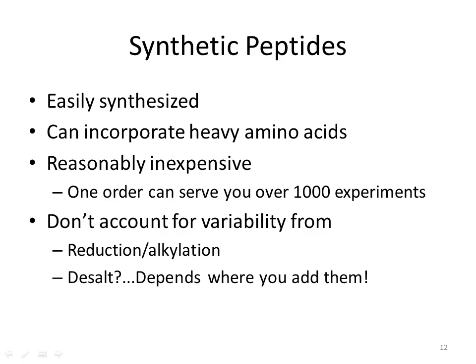So can your synthetic peptide account for desalt variability if you add it before the desalt? Yes, it can. Some people don't like to add it before the desalt because you don't always get 100% recovery through that step. If you add it before the desalt and you lose a little signal compared to adding it after the desalt, that's actually okay, because it's taking into account your analyte signal that may be lost too. And then you're getting closer towards accurate quantitation.